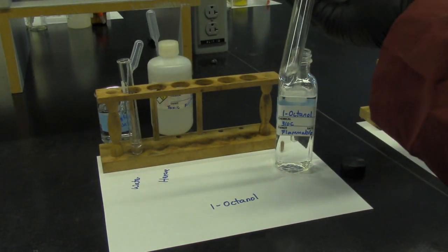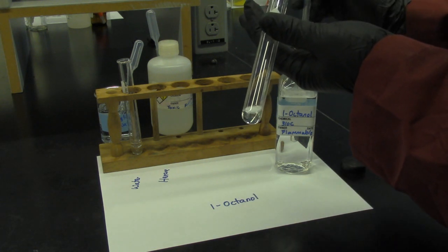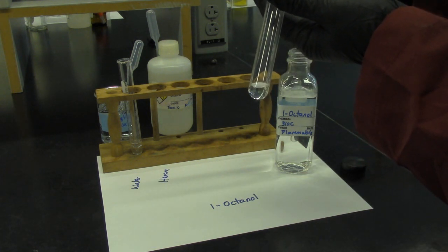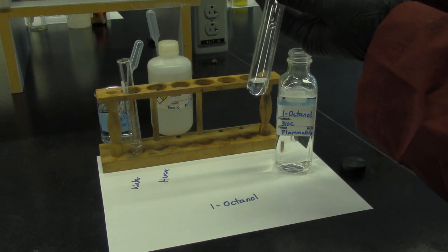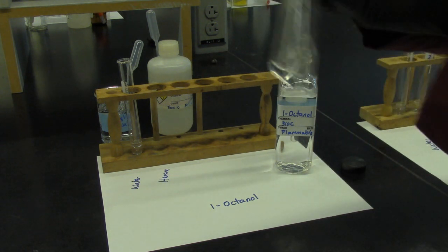Hexane. 1 ml of hexane in the second test tube, and a few drops of octanol. Shake.